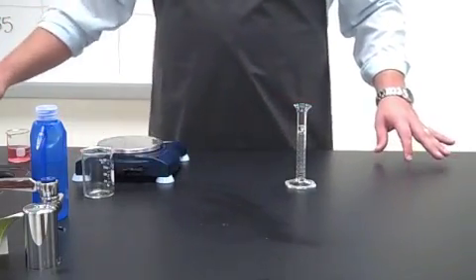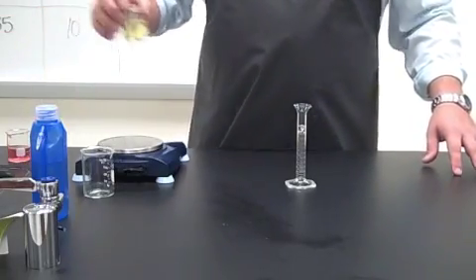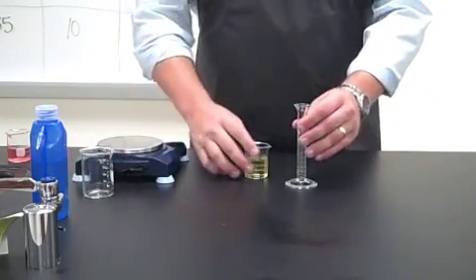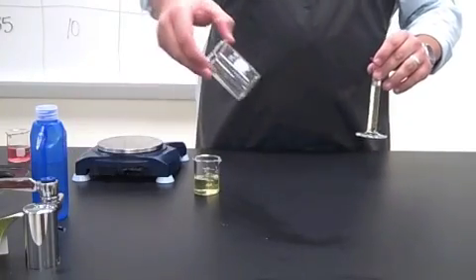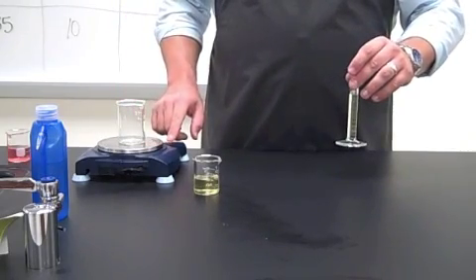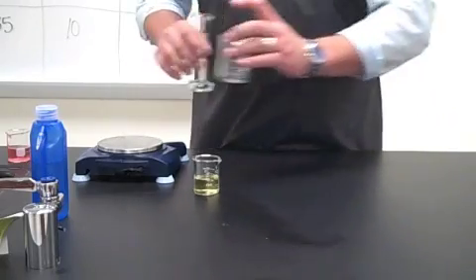We're going to move on to our next sample solution, which is our yellow, that has a 10% mixture of sugar and water. Go ahead and measure out 10 milliliters of that. We're then again going to take our 100 milliliter beaker, put it back on our balance, zero it out, and then add in the 10% mixture of sugar.